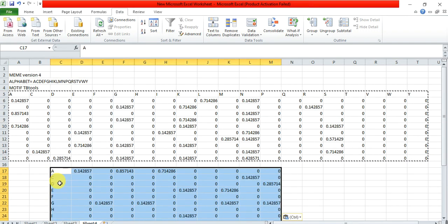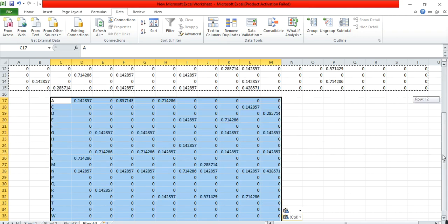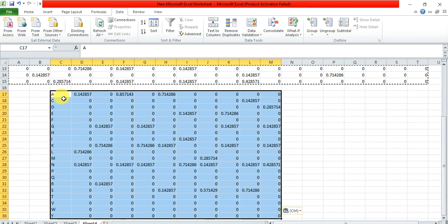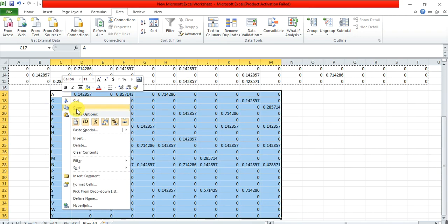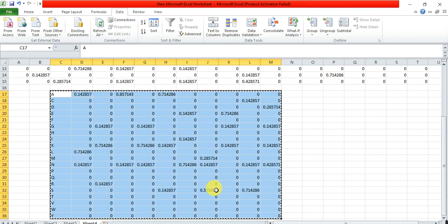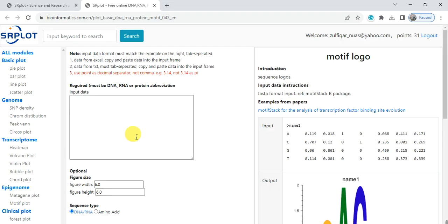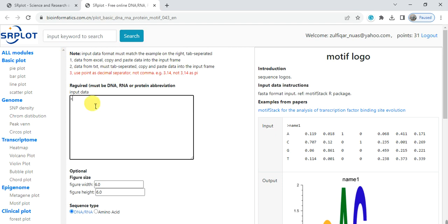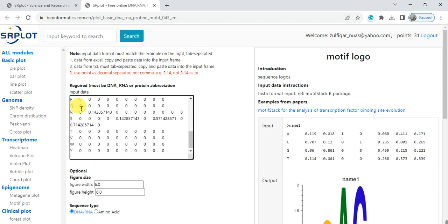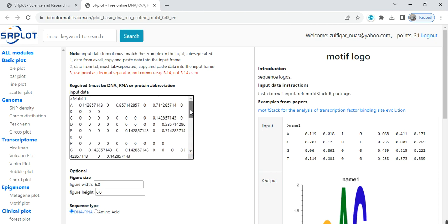Open that website, first give the name, for example Motif 1, and paste in this box your position weight matrix of each amino acid.